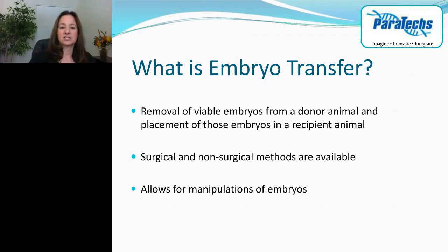First, I'd like to talk to you a little bit about what embryo transfer is. Quite simply, it's the removal of embryos from a donor animal and placement of those embryos into a recipient. Both surgical and non-surgical methods are available, and the use of embryo transfer allows researchers to perform manipulations in embryos for research. And these manipulations occur in vitro.